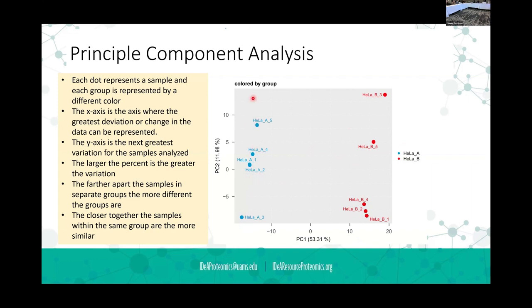But inside, you've got some variability within the group. And you're not always going to get really, really tight clustered points together. And sometimes that's okay. It is what it is.